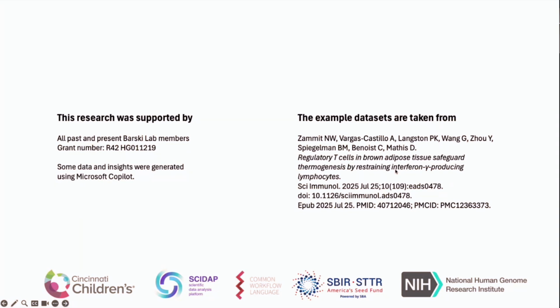I think the other question I have would really be around visualizing corrected counts from limma, which I'm guessing is the removeBatchEffect function, where you've passed in a certain design. Yes. Do you ever run a pipeline the same way with and without that visualization, just to ensure that it's not a single sample that's driving that effect?